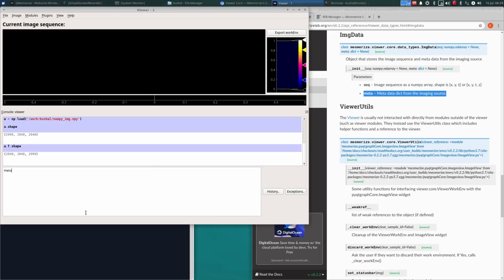So let's say meta equals. So one key that's needed is origin, which is just for you to know where the data came from. Let's say it's my 2-photon microscope. Well, this is actually a 1-photon image, but anyways. The sampling rate of the data should be stored as fps. Let's see, so it's 10. And fps is a very important piece of metadata for downstream analysis.